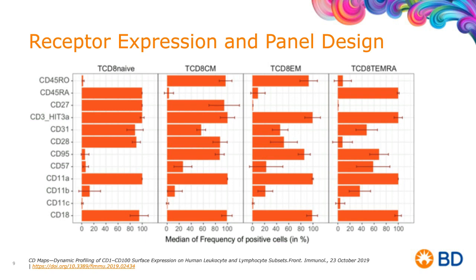But if we look at something like CD45RA for the central memory versus the naive population, you can see where you might be able to use a color a little bit differently, and where something that might spread into another specificity like RO, we can put the right color in the right place.